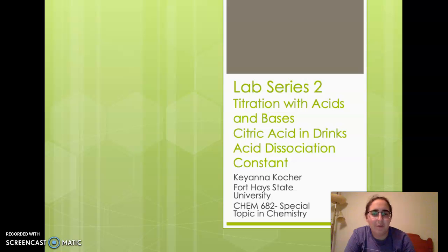Hello, here's my video for Lab Series 2. So there's 3 separate labs in this series. There's a titration with acids and bases, there's a citric acid in drinks lab, and then an acid dissociation constant lab.